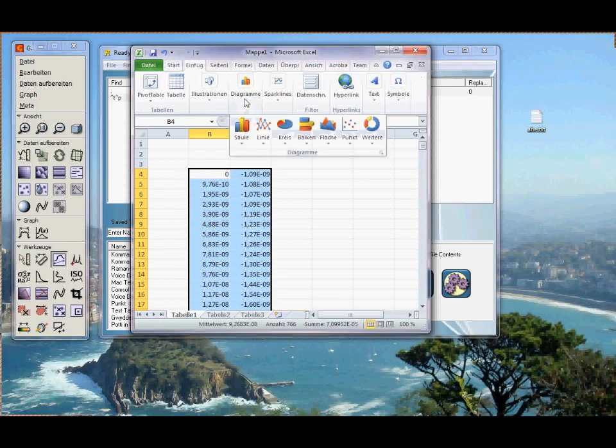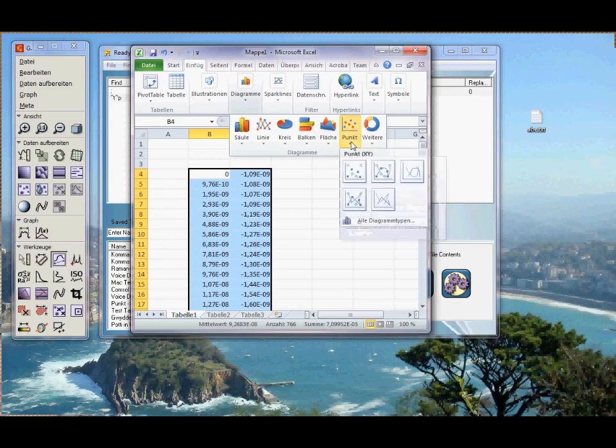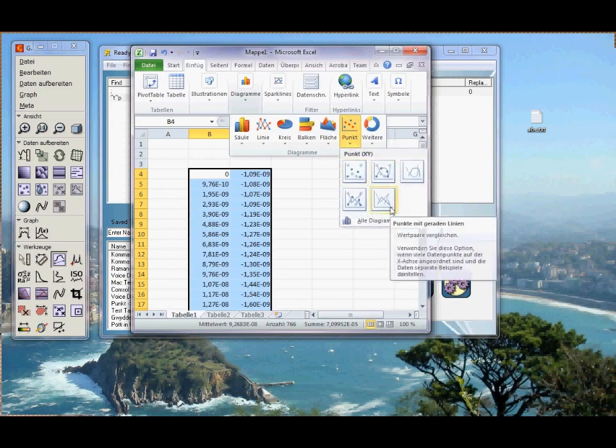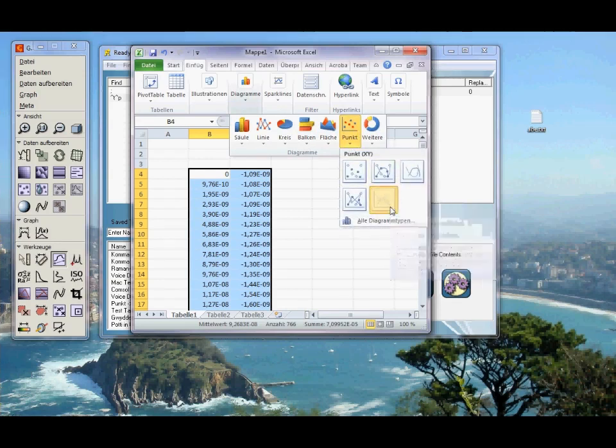Insert a diagram, a point diagram with connected lines. And that's it.